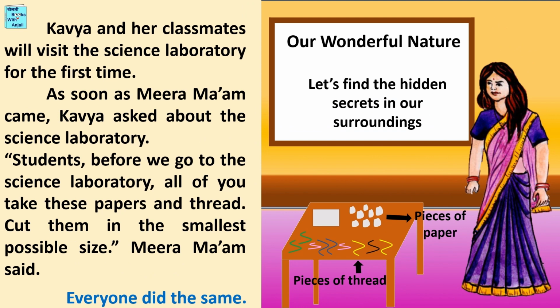Kavya and her classmates will visit the science laboratory for the first time. As soon as Meera ma'am came, Kavya asked about the science laboratory. Students, before we go to the science laboratory, all of you take these papers and thread. Cut them in the smallest possible size, Meera ma'am said. Everyone did the same.